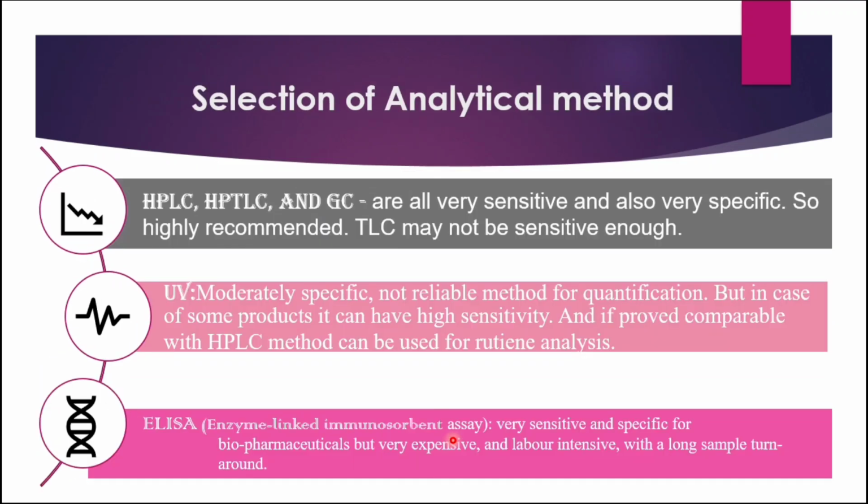So, how to select the analytical method? What is the criteria for selection of analytical method? What are the advantages of different methods? We are going to discuss now. For example, if you use HPLC, HPTLC and GC method, all these methods are sensitive and also very specific. So it is highly recommended to use HPLC method or HPTLC method. TLC may not be sensitive enough. So only TLC method is not at all recommended.